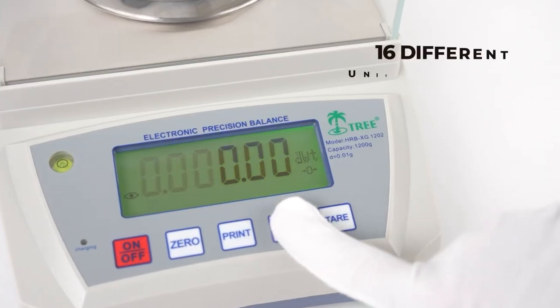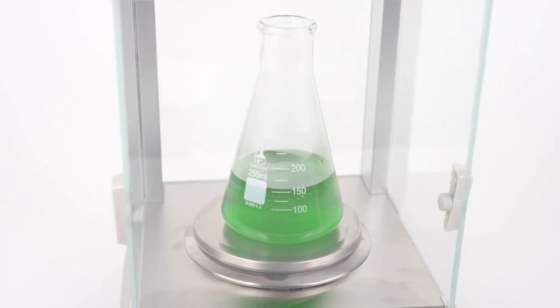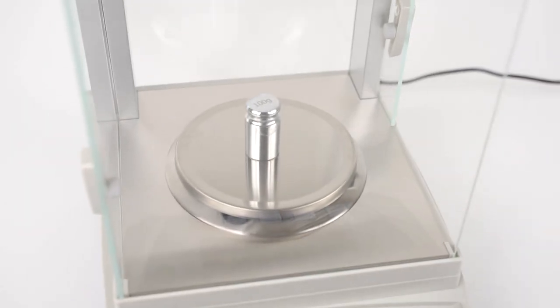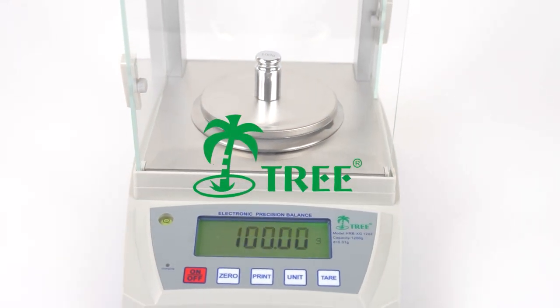Both offer 16 different unit conversions and expert calibration from AnyCal software by Tree, so you can calibrate with any known accurate weight from 25 to 100% of balance capacity.